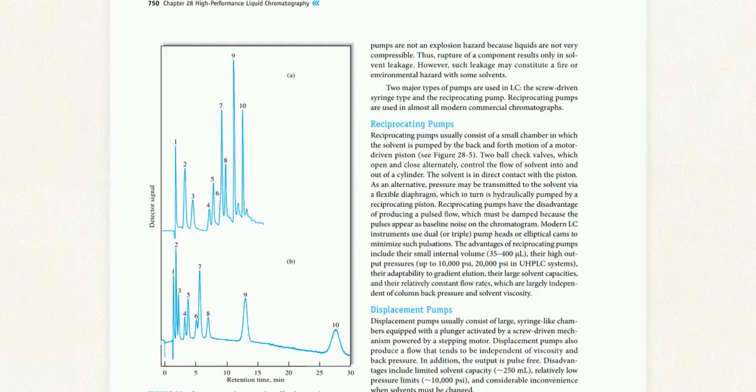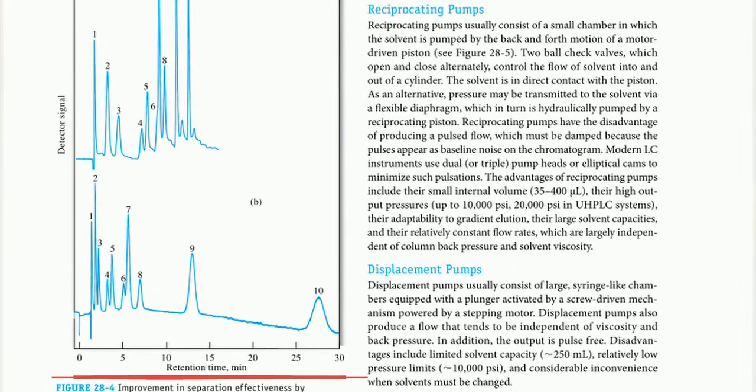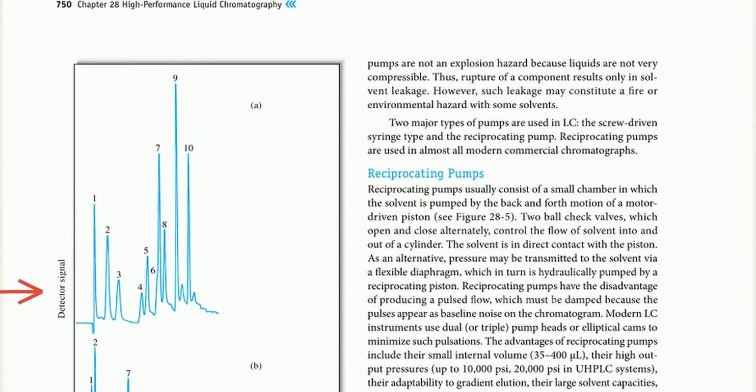This is a chromatogram. It is the final graph plotted by the computer based on those light intensity signals coming from the detector. The horizontal x-axis tracks retention time, how many minutes it took for a specific compound to travel from the injection valve to the detector. The vertical y-axis measures the strength of the detector signal, which tells us how much of that compound was present.